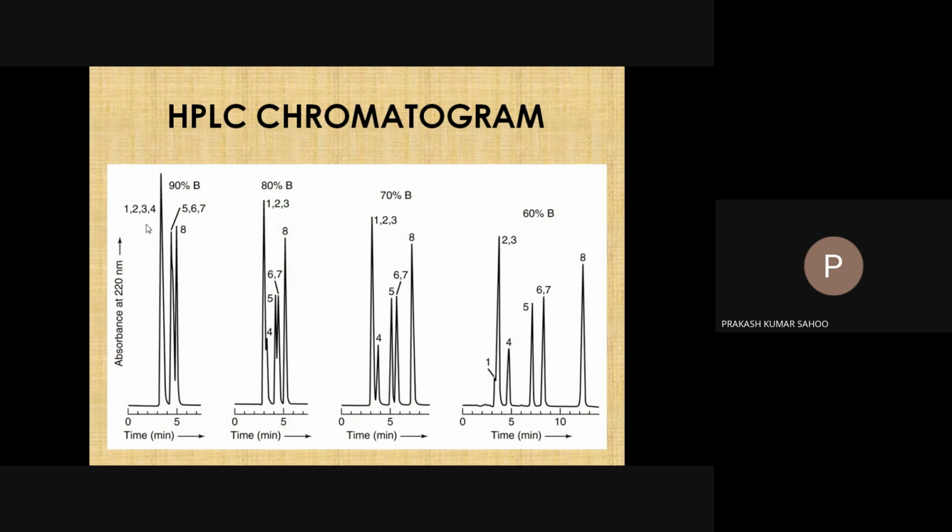So these are some HPLC data with some graphical representation, that is absorbance at 220 nanometer, with your time in minutes.